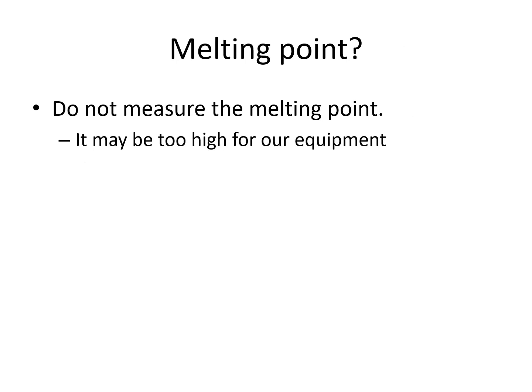Melting point, as you know, is one of the important techniques which we use in organic chemistry laboratories to check the purity of a solid compound. However, the melting point of the dibromide is very high.